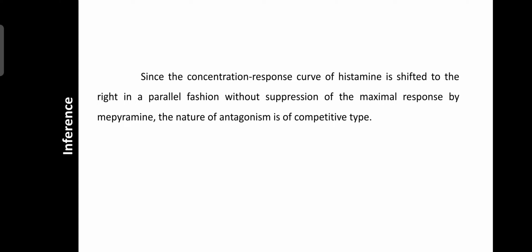Inference: since the concentration response curve of histamine is shifted to the right in a parallel fashion without suppression of the maximal response by mepyramine, the nature of antagonism is of the competitive type.